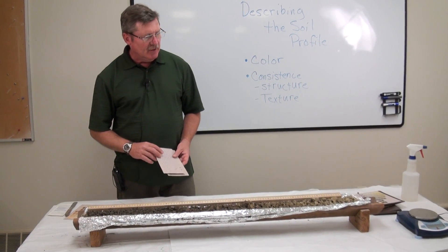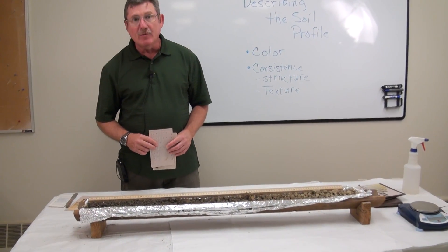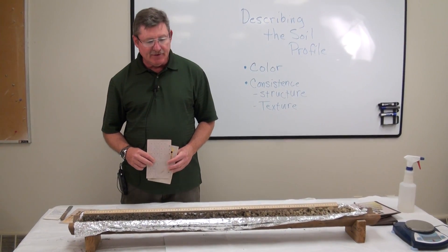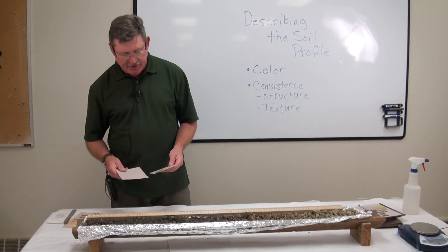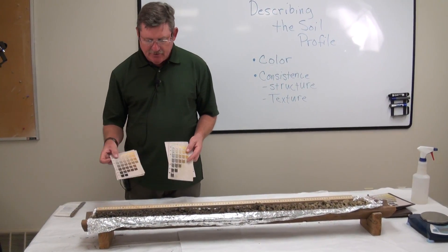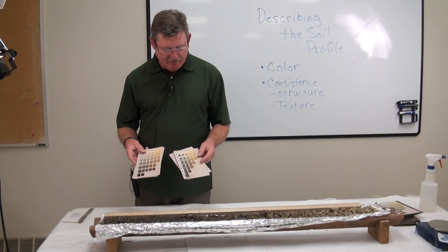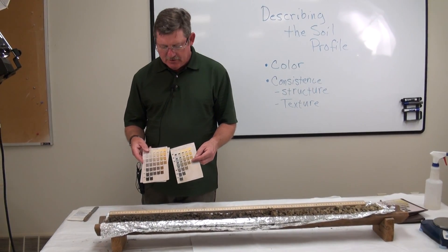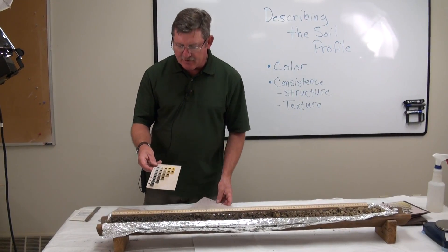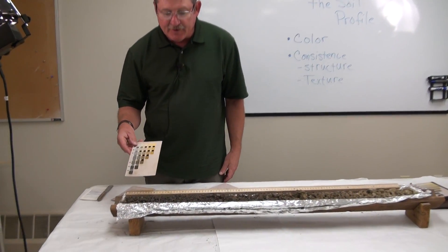Determining soil color. We're going to do the Exarbon soil profile here, and this is done with the Munsell color pages. We've previously looked at this and compared 10 yellow red and 2.5 yellow for color matches, and we think the 2.5 yellow is going to work best. Starting here at the top soil.